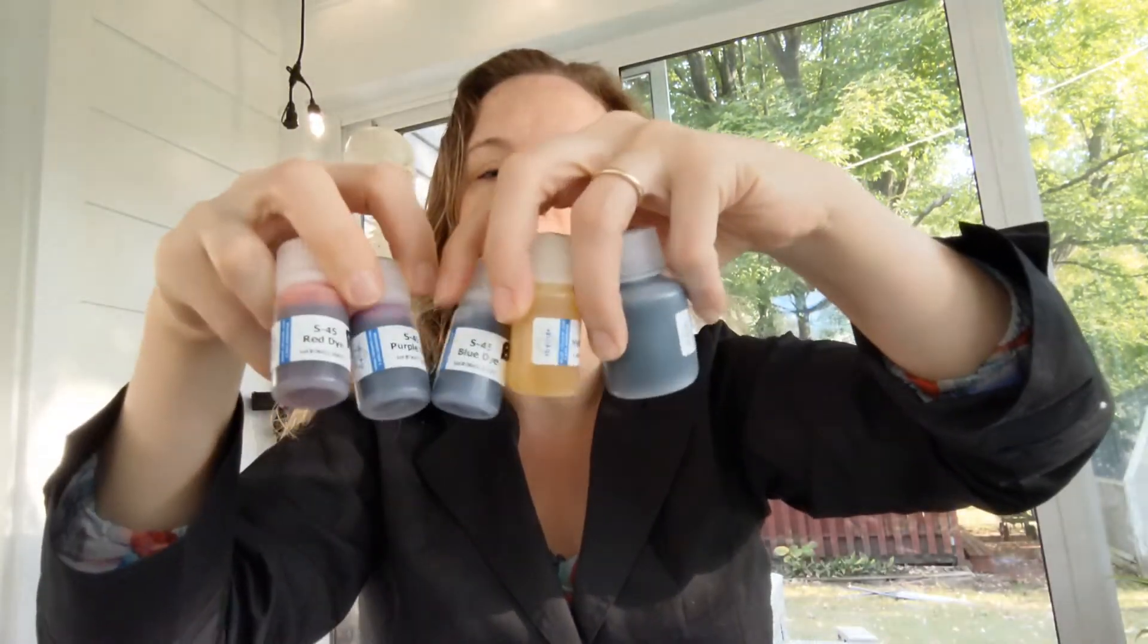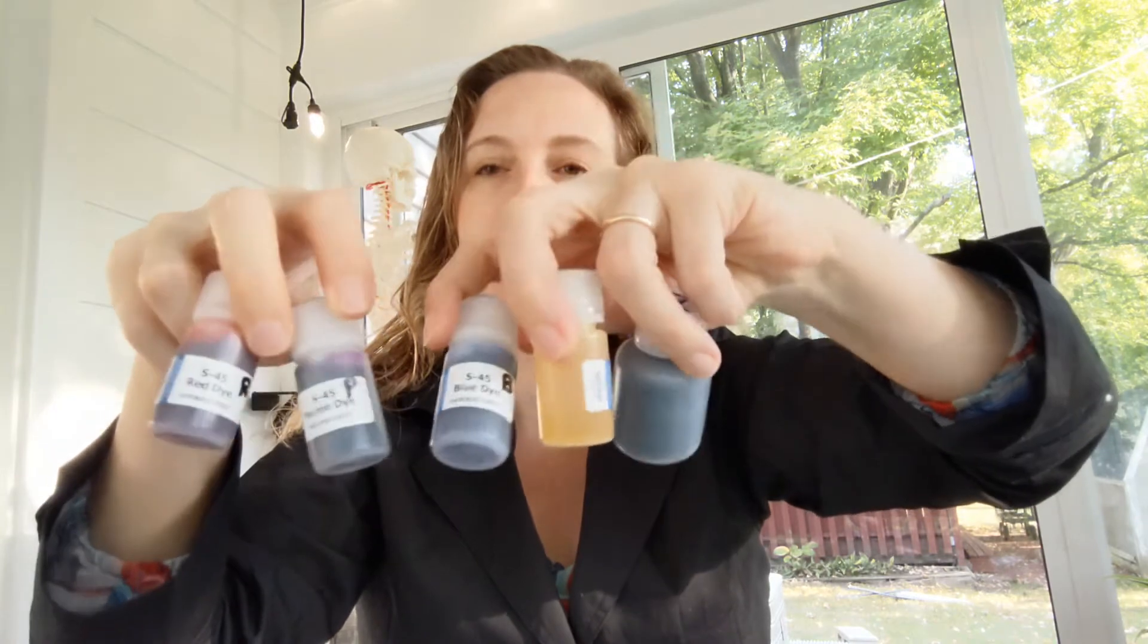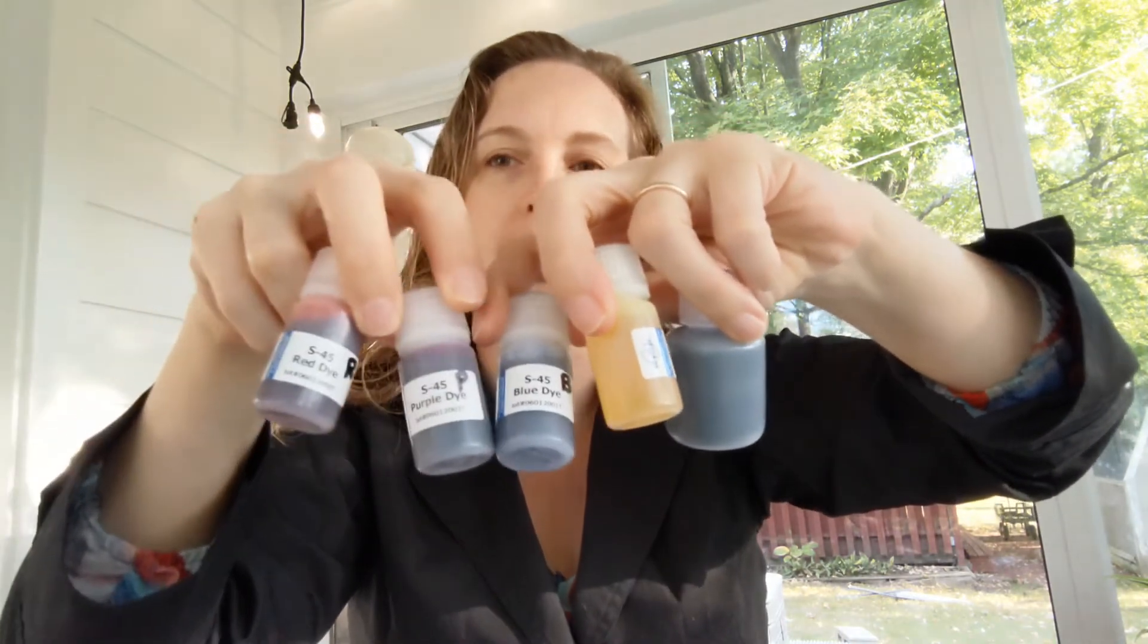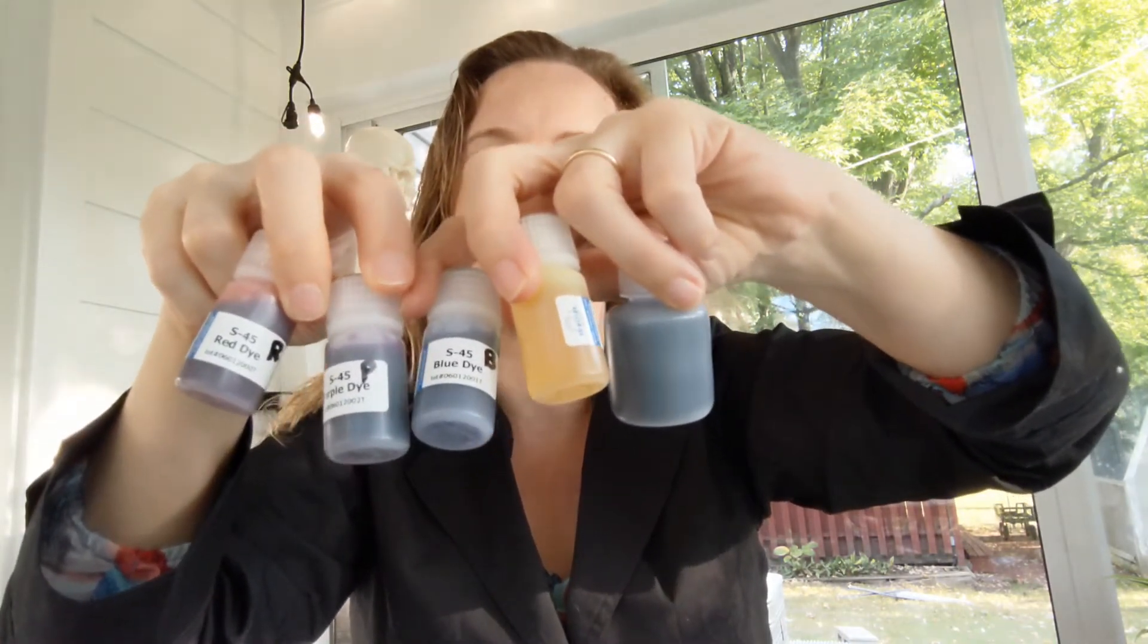I love this because the prep for it is so simple. You get your five bottles of dye: navy, yellow, blue, purple, and red. And I went ahead and did the letters on the side.